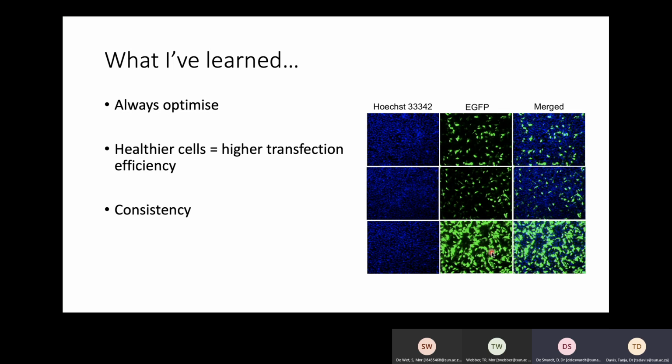Well, in most cases, the signal from the fluorescence will be what you would expect from that fluorescent molecule. But I have seen that sometimes certain cells just don't like, for instance, fluorescent proteins, and certain cell lines are also really quite resistant to transfection.